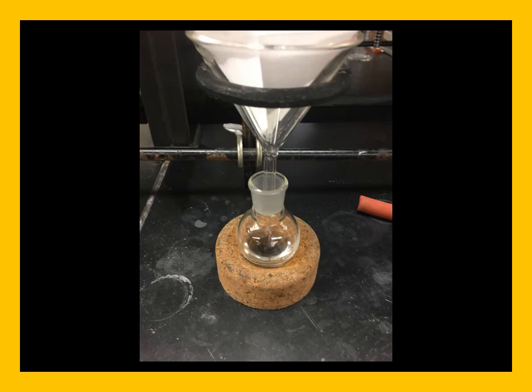Remember, my goal is to get all my product dissolved in my dichloromethane off. I don't need to transfer all the sodium sulfate to the filter paper. So I used several mils of dichloromethane to transfer it. Now, once I had all of my dichloromethane solution in my round bottom flask, I blew air over the solution in order to evaporate the dichloromethane into the hood, but I could have also set up the Rotavap and used the Rotavap to remove the solvent. The advantage of using the Rotavap is it allows us to reclaim the solvent, so that's usually a better choice for removing organic solvent, is to apply a vacuum and remove it into the Rotavap.